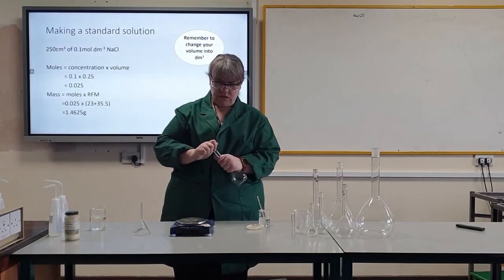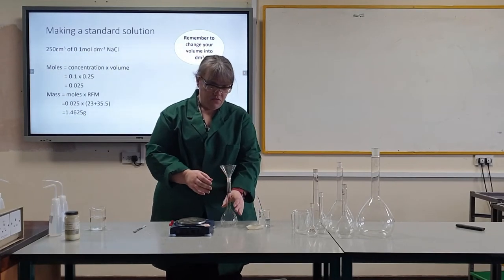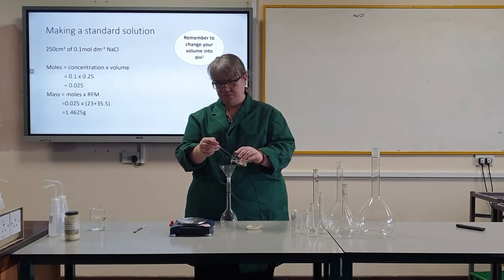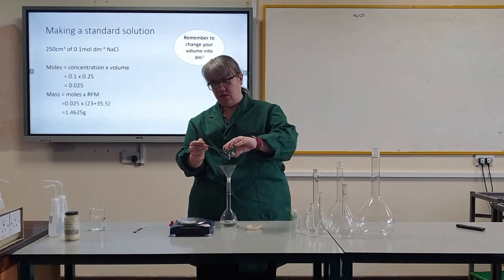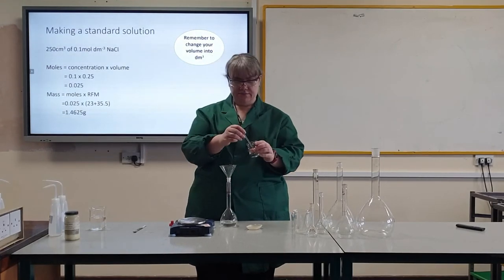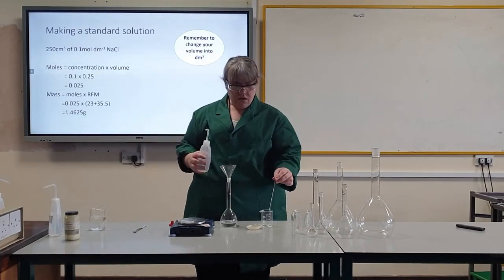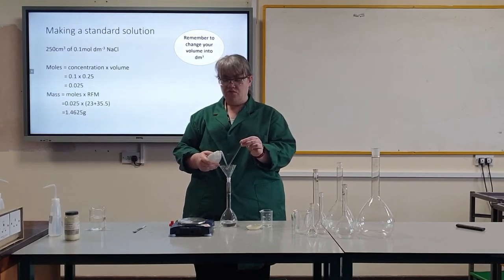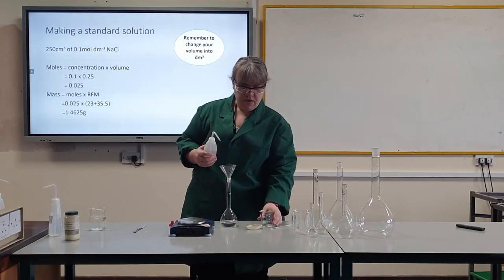Once that's dissolved as much as possible, I get my funnel into my volumetric flask and pour this solution in. All of my glassware has been rinsed with distilled water before the start. Now I rinse every piece of equipment that has been used with the solution, so I am going to rinse my stirring rod. This is to make sure all of the sodium chloride goes into my volumetric flask.